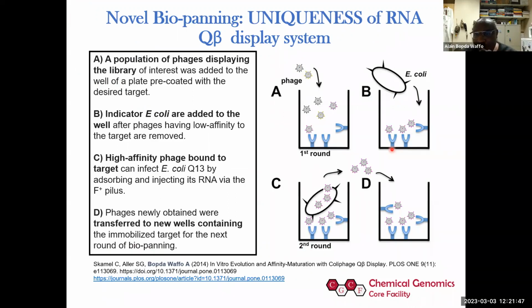And we pour the library on the well containing the monoclonal antibody. And we will wash it. That means we remove the non-binding, and we will amplify the difference between M13 and Qβ. M13 needs acidic elution. One, you wash away those non-desired candidates. You have to amplify those sitting on the target.